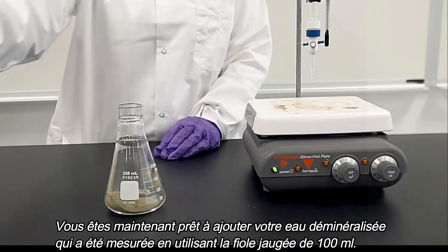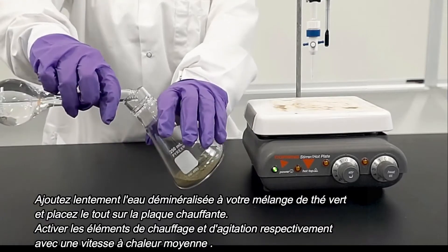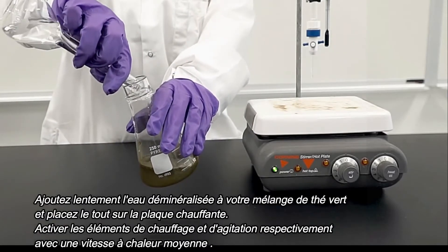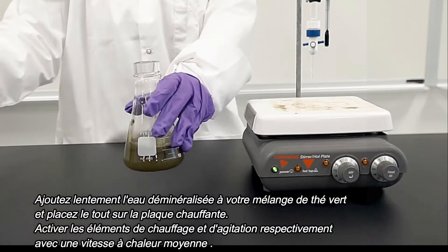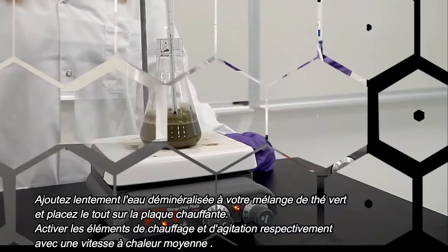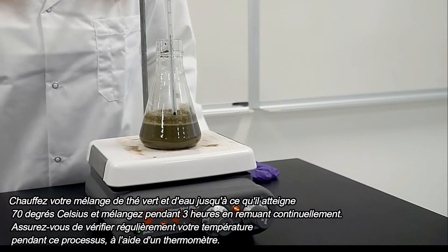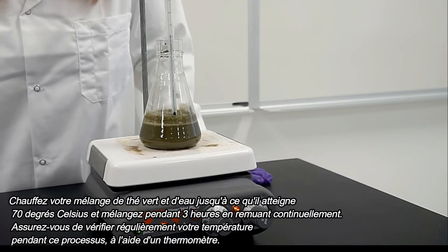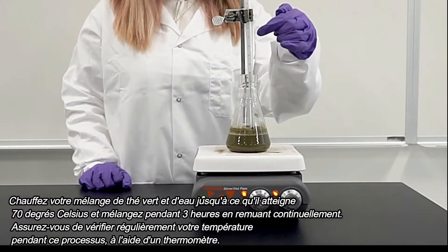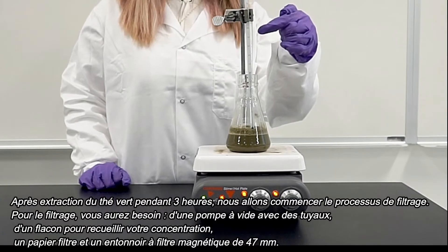You are now ready to add your DI water that was measured using a 100 milliliter volumetric flask. Slowly add your DI water to your green tea mixture and place it onto the hot plate. Turn both the stirring and heating elements on to medium. Heat your green tea and water mixture until 70 degrees for three hours using continuous stirring. Make sure to check your temperature regularly using a thermometer. After your green tea has been extracting for three hours, we will begin the process of filtering.